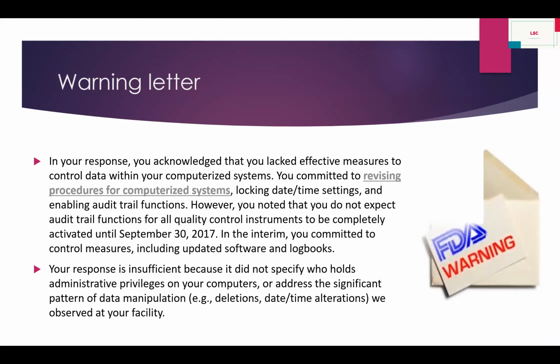In your response, you acknowledge that you lack effective measures to control data within your computerized system. You committed to revising the procedure for the computerized system, locking date and time settings, and enabling the audit trail function. However, you noted that you do not expect the audit trail function for all the quality control instruments to be completely activated until this time. In the interim, you committed to control measures, including updated software and logbooks.